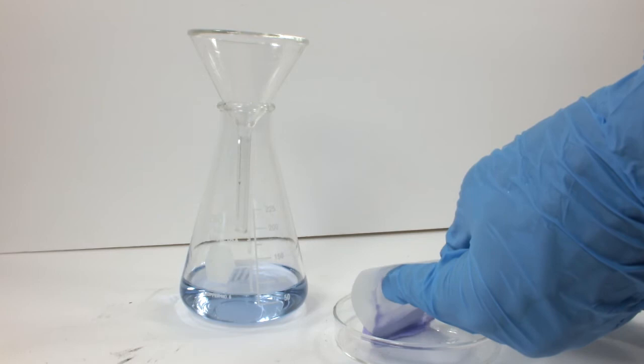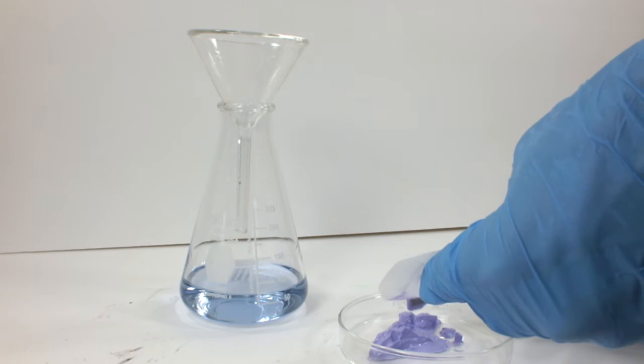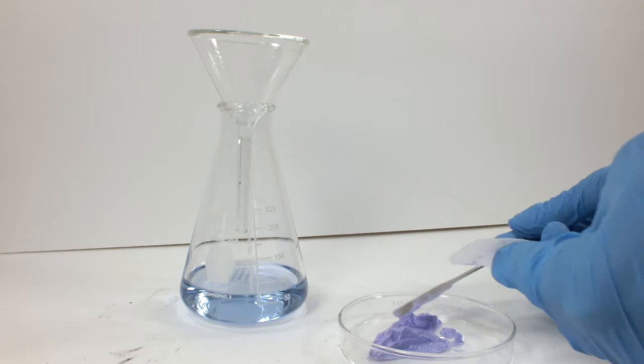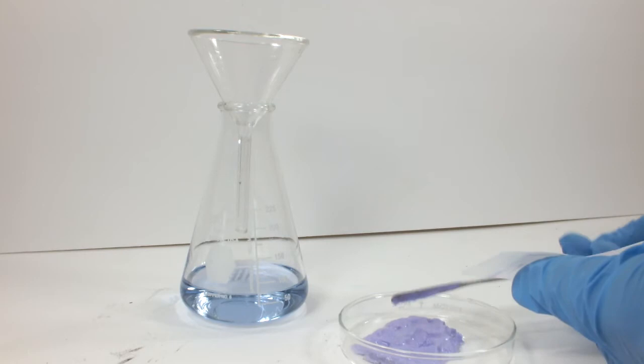The same as with the sulfate complex, I'm going to scrape the wet solid onto a glass dish for drying. Look at that color. Most nickel compounds are some shade of green, and here I've just made two that aren't. That's pretty cool all by itself. Let's see what they look like dry.